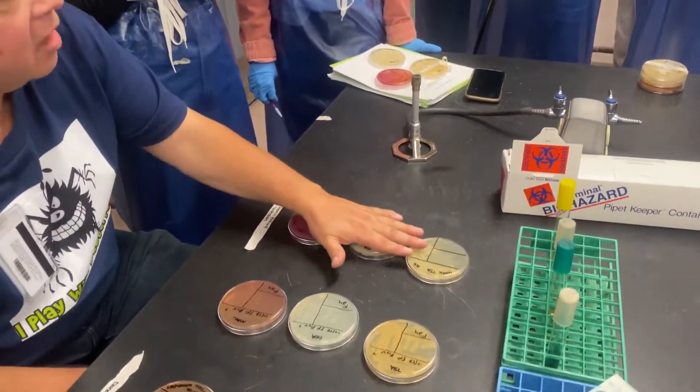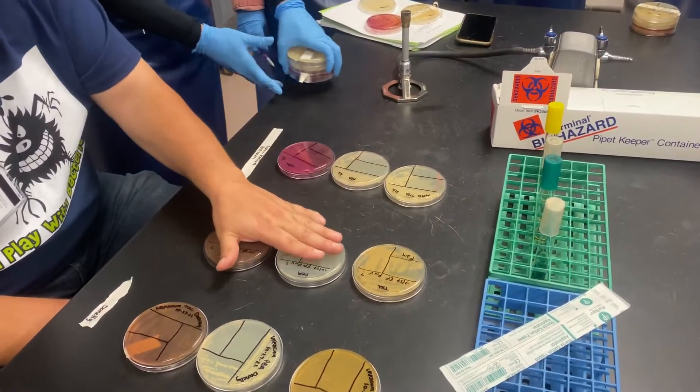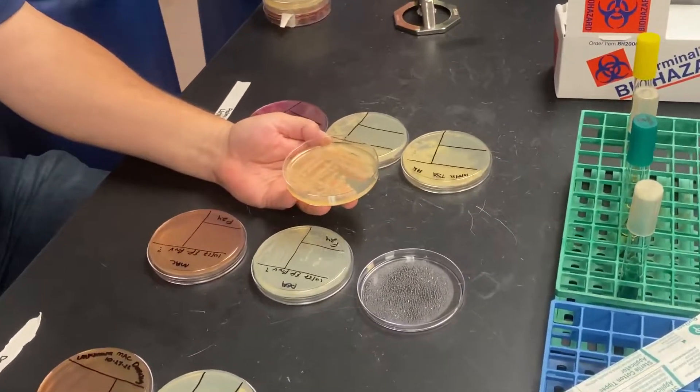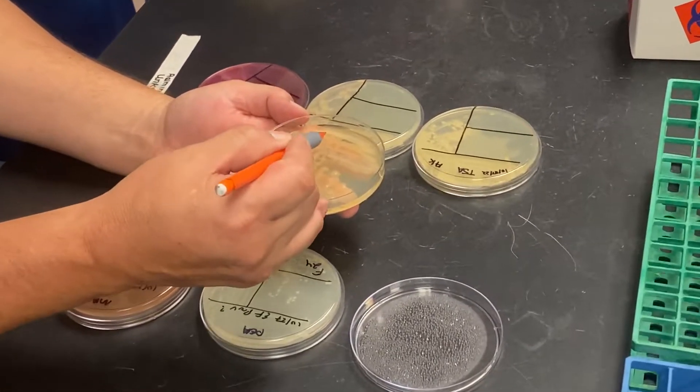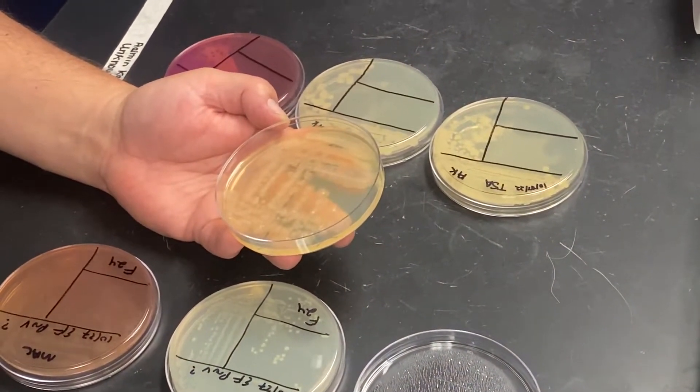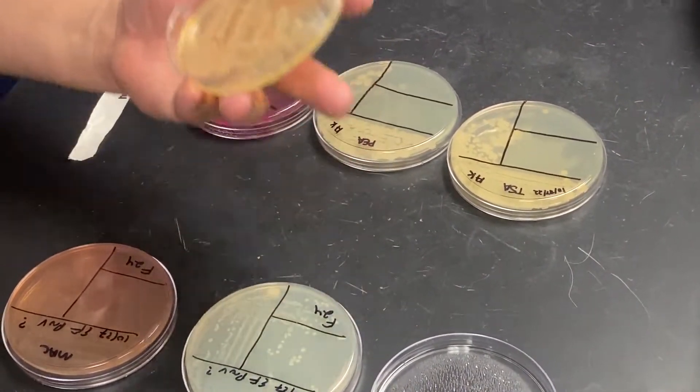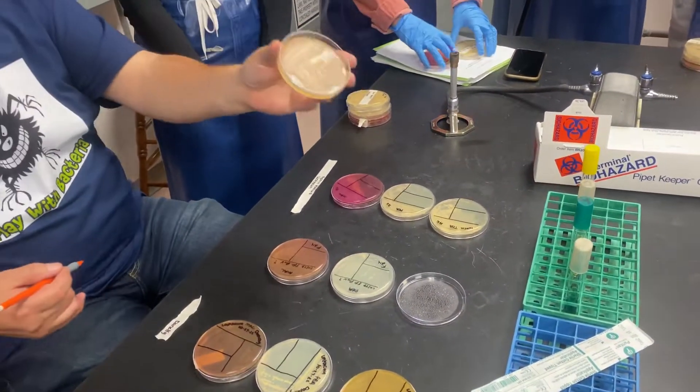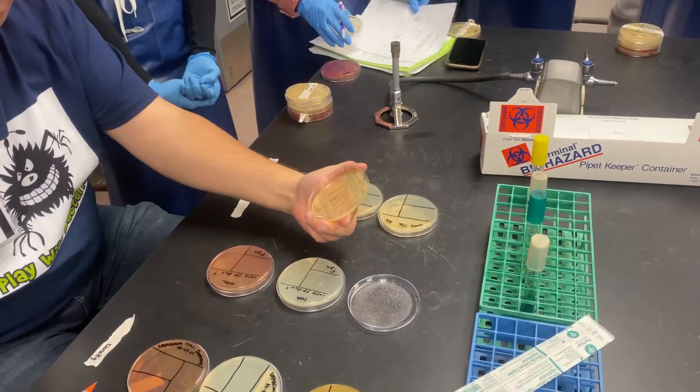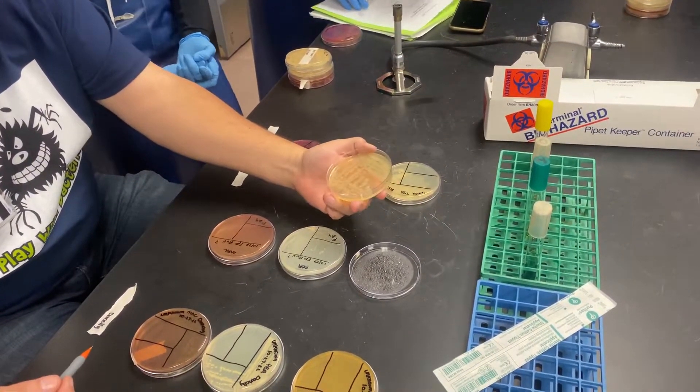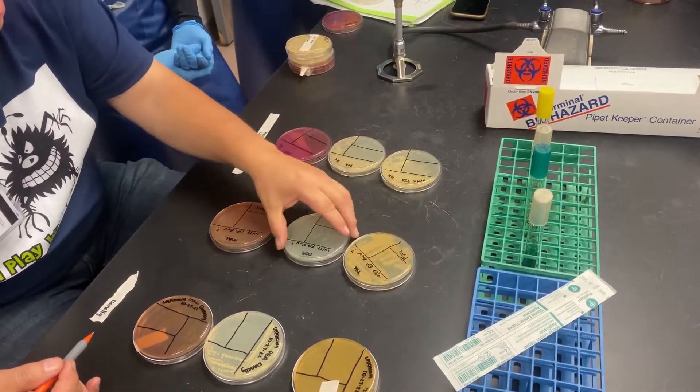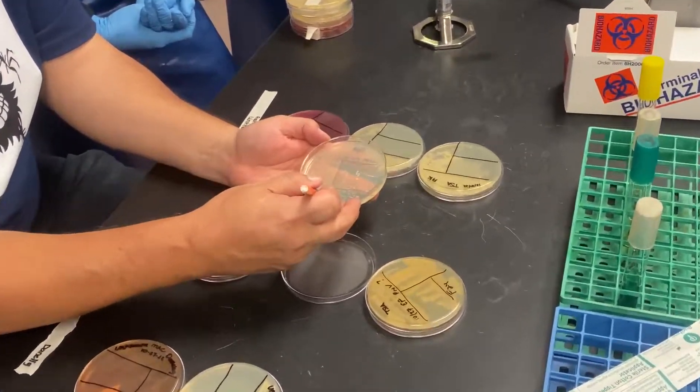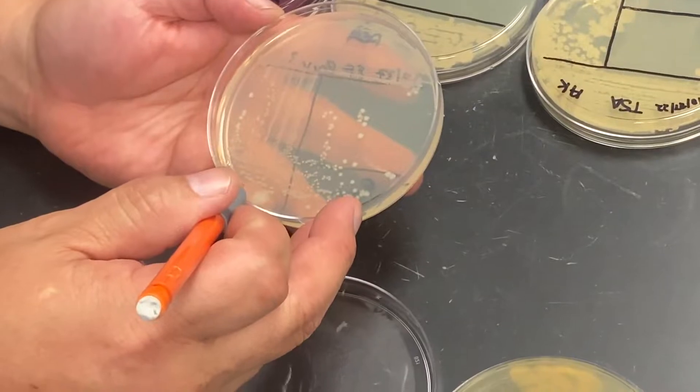Okay, so now, this is Alamine's, right? This one is Eric's. Eric has got a whole different situation going here. When you look at this plate, it looks like he's got a pinkish orange colony growing here. But it's hard to see anything else. And this one smells fruity. Yeah? So Clarissa doesn't think it's fruity, right? So here it's growing, looks fruity. And here is a different organism that doesn't look fruity. And here is the fruity looking one, but it's inhibited.